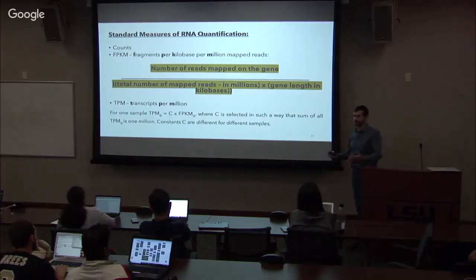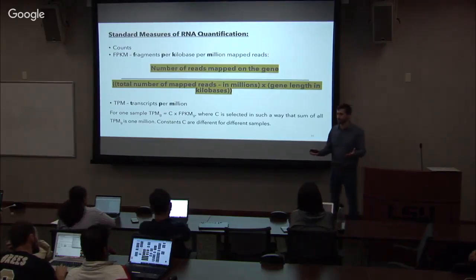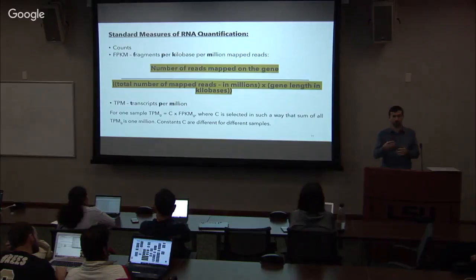The second consideration is, let's say I have a bucket that is 100% full and a bucket that is 50% full. So I just have different amounts that I'm comparing. Because one is 100% full and the other 50% full, I'm already going to expect that in the differential gene expression, a lot of genes from this bucket are just going to have higher expression, even though that's not really representative of the biology, because the biology should be related to what's overall happening in that specific sample.